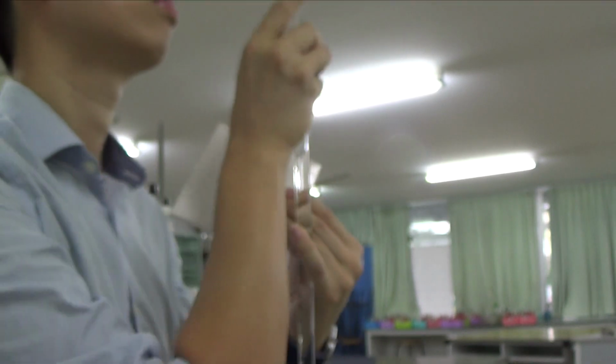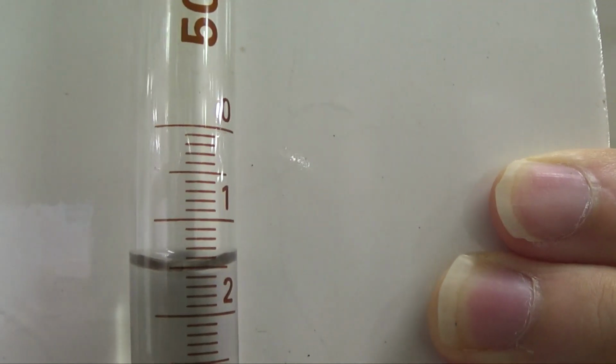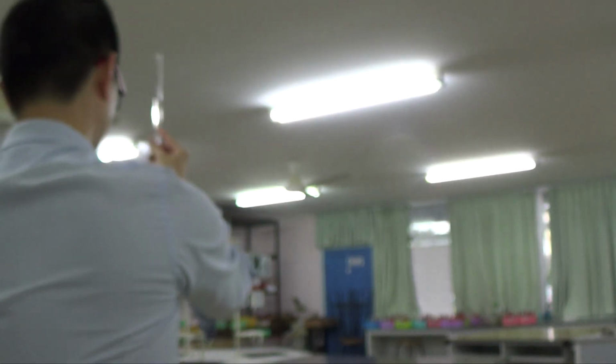So that one again is 1. This is a bit tricky. It's now 1.5 cm cube. Maybe it's 1.5 cm cube then. Okay, but this being my first titration, a rough titration shouldn't matter that much. So 1.5 cm cube.